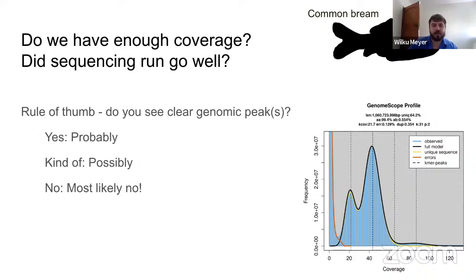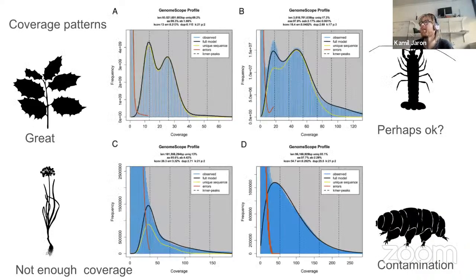Well, since it fits the model and there are two clear peaks, it shows that it has enough information to be able to get good context for the assembly. Yeah, I think that's exactly right. So the whole point is that just looking at this plot, you can kind of tell that errors and the template sequences within this dataset are distinguishable. They form unique peaks. They look like it could work. Why not?